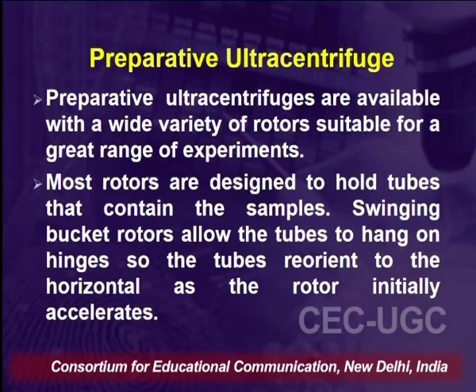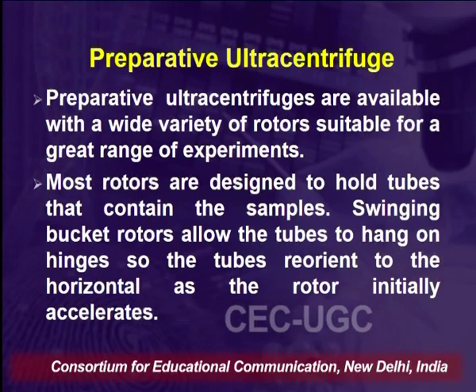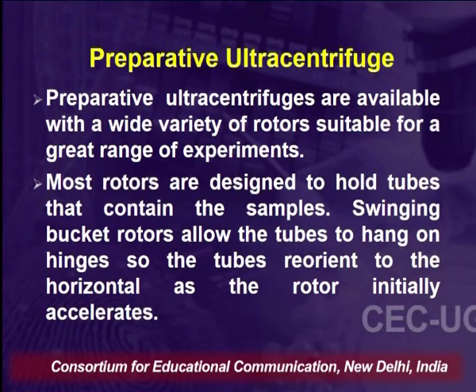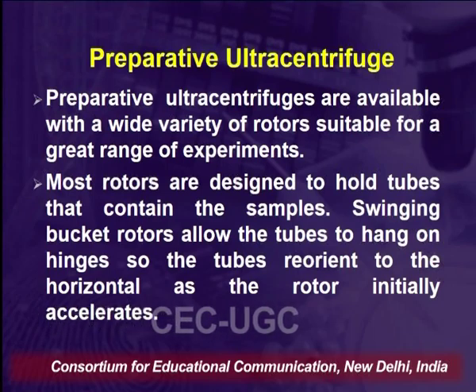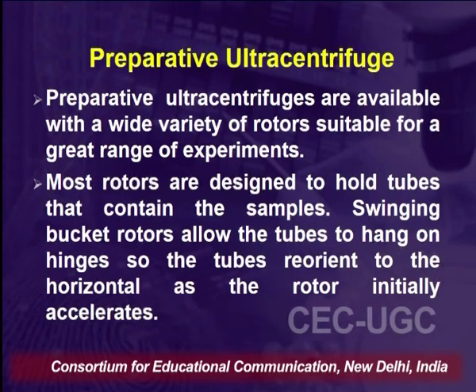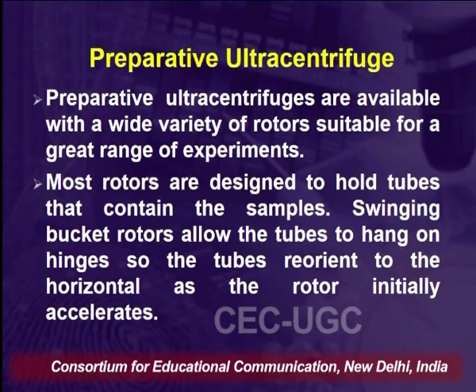Whereas when we talk about the preparative ultracentrifuges, they are available with a wide variety of rotors which are suitable for a great range of experiments. The rotors are designed to hold tubes that contain the sample. As we discussed about the fixed angle rotor and swinging bucket rotor, they allow the tube to hang on hinges so that the tube reorients to the horizontal as the rotor initially accelerates.